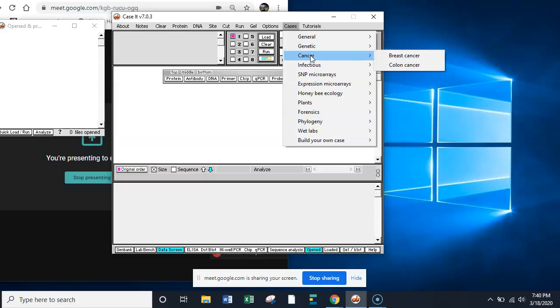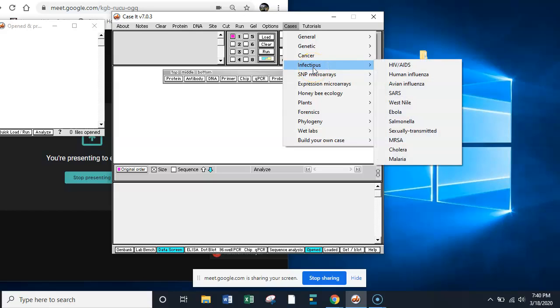We'll definitely do one or both of these. I might do this one real quick today because this is somewhat relevant. You can actually do a little quick PCR diagnostics of the SARS virus. So this is like the first one. It's the same one we're dealing with now. Now we're dealing with COVID-19, but this is like MERS and SARS or those kinds of things.